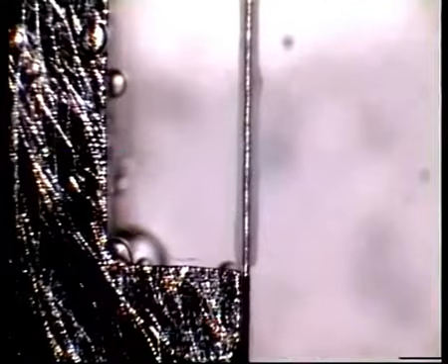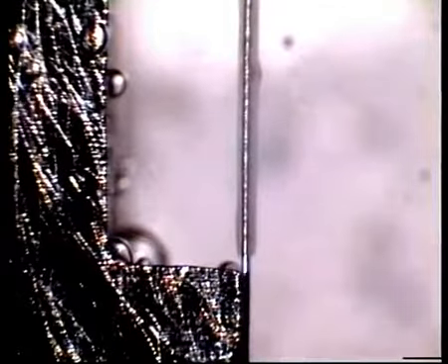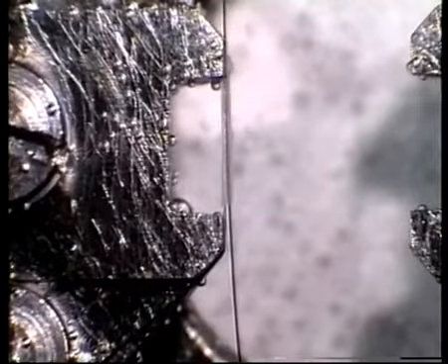If during any of these procedures you observe that the vessel is contracting or providing resistance, do not force the wire through, as you will damage the vessel. In our experience, what you can do in this situation is to let the vessel rest for a while. Change to new cold physiological salt solution and resume the procedure after a break.